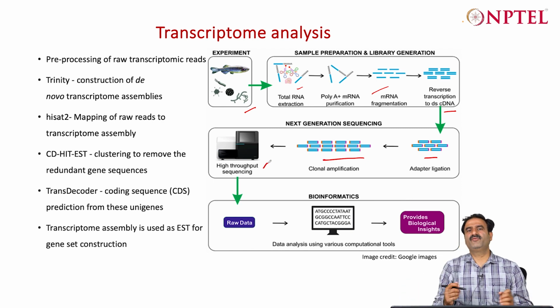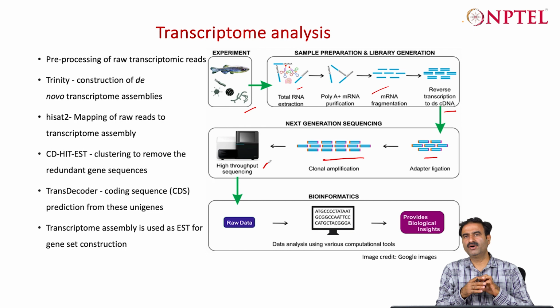So generally for one genome, about 15 to 25 GB of transcriptome data is sufficient to cover the entire diversity of the transcripts which are there, and also to recover a well constructed transcriptome. If you have more budget, you can go for higher also, but 15 to 25 GB is good enough for a transcriptome from a tissue.